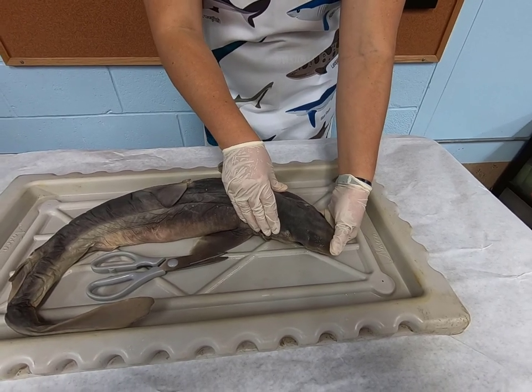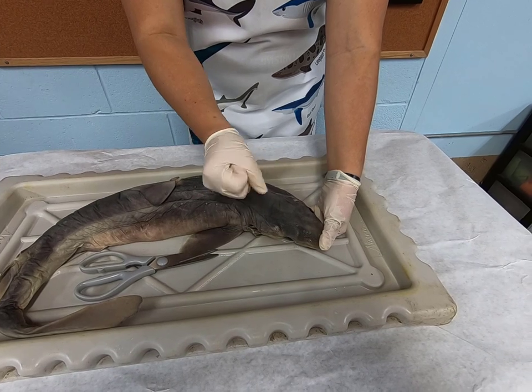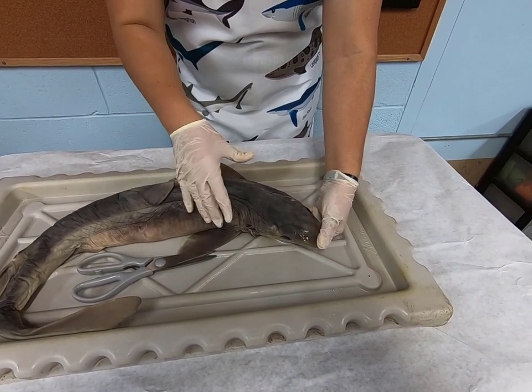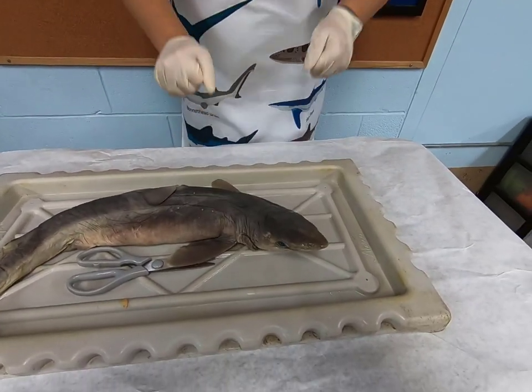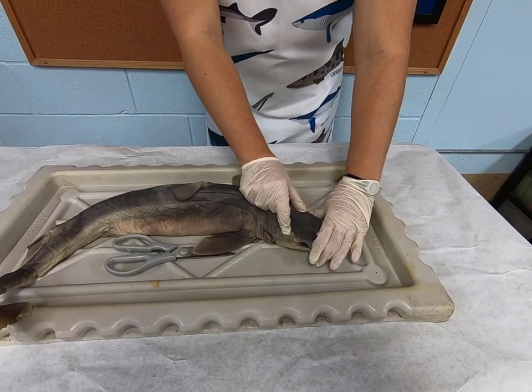Stingrays use this as well. They have the spiracles on the top and they move, open and close, and they'll pulse and bring that water through. Stingrays, if you've ever seen them, have gills on the bottom half of their body. So if they were to suck up water, they'd suck up a ton of sand. So spiracles are miracles for sharks and stingrays.